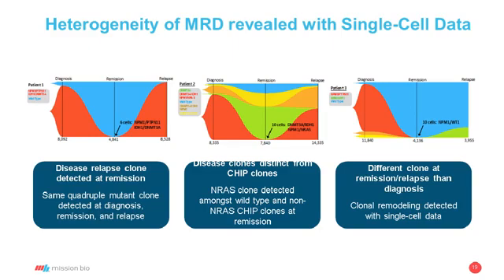The middle graph is looking at a very complicated evolutionary path, where you have many subclones during the diagnosis stage, and also many subclones that are retained during the relapse. The third case is really unique in the sense that all of the subclones that were there during diagnosis were treated, but then a brand new subclone with a different set of mutations, the green subclone, was ultimately the cause of the relapse.